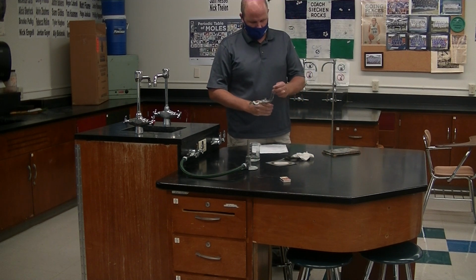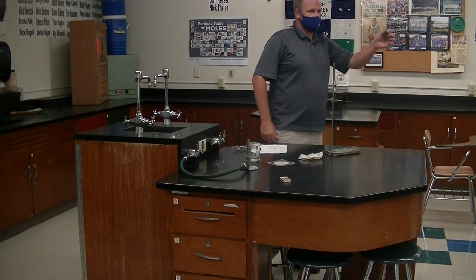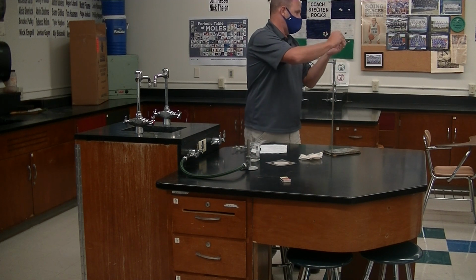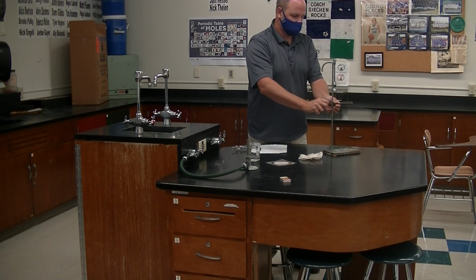What does a ring look like? This is a ring. This is an iron ring. Does that make sense that it's an iron ring? Iron rings have this little clamp part on the back, and they will go on the back of the ring stand. So they go just like this.